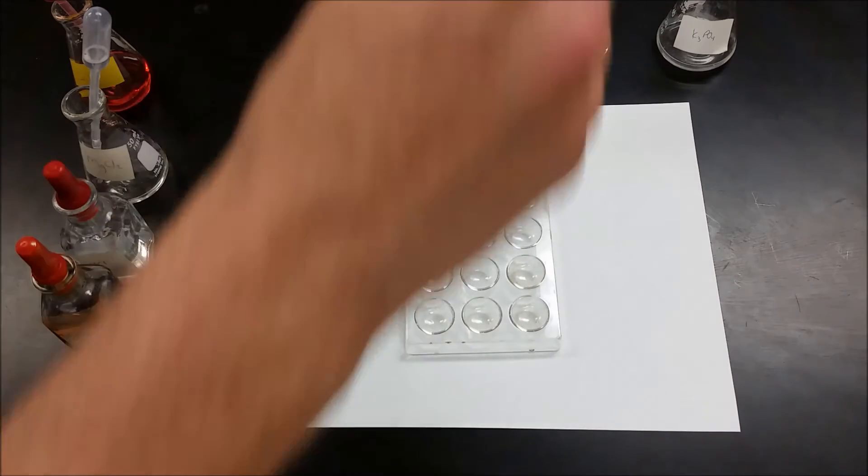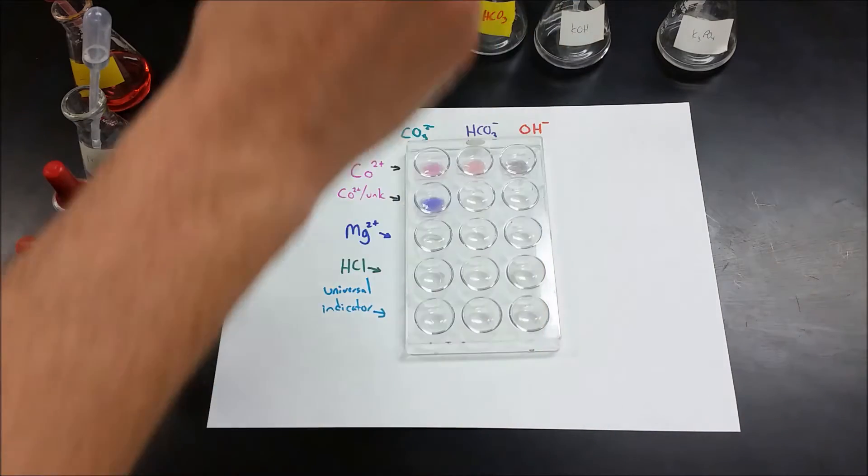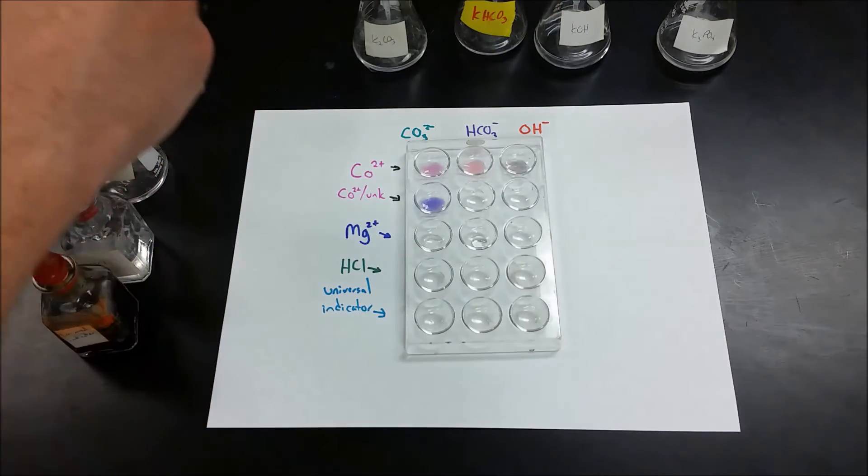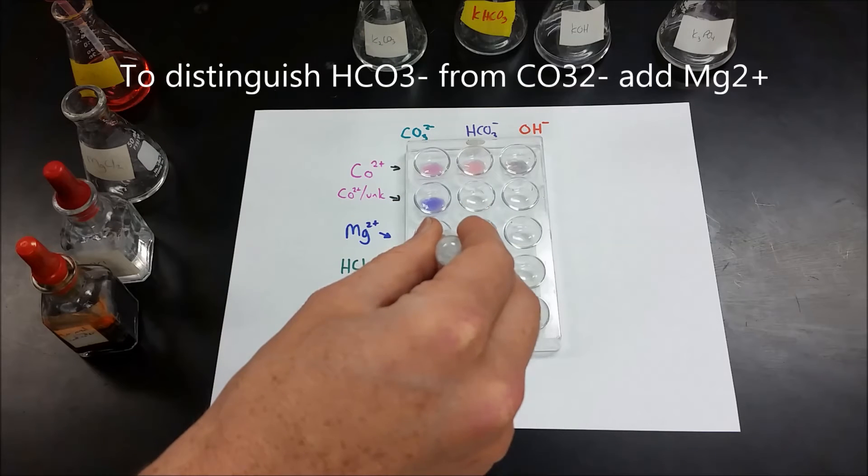So the next test we're going to do is we're going to put some carbonate down here, bicarbonate next to it. Then we're going to add to that any magnesium compound. I have magnesium chloride here.